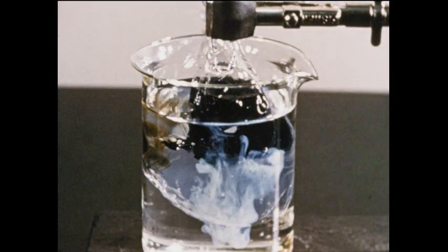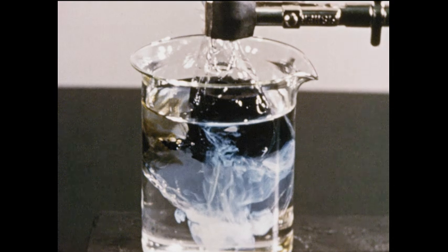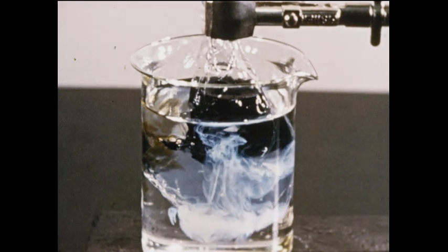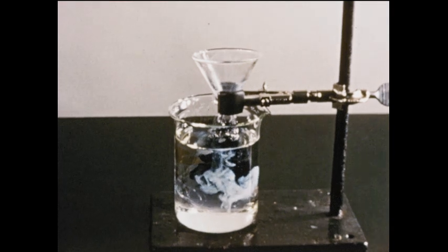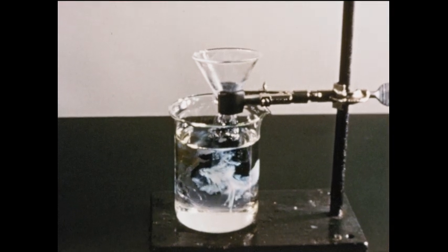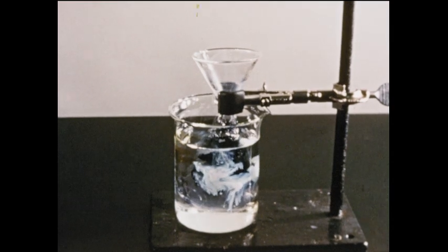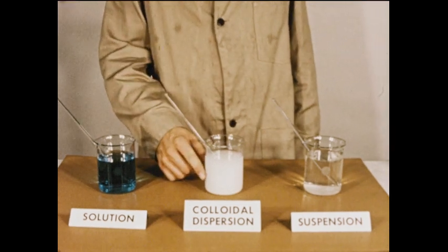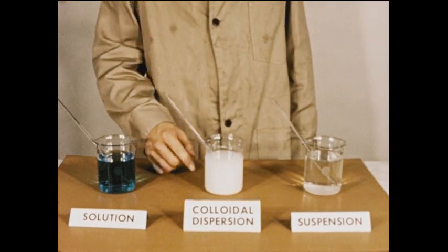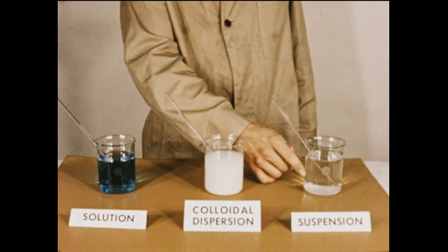It does show the presence of salt in the water, so the salt, in solution, passed through the membrane. The starch, in the colloidal state, did not. Colloidal particles, then, must be larger than the molecular-sized particles of solutions. And so particles in a colloidal dispersion are between the smaller size of particles in solutions and the larger particles in suspensions.